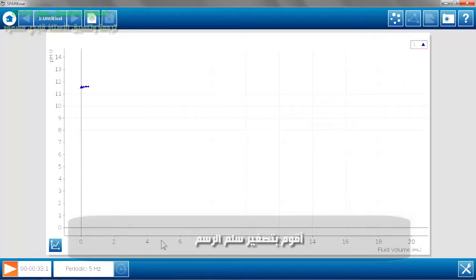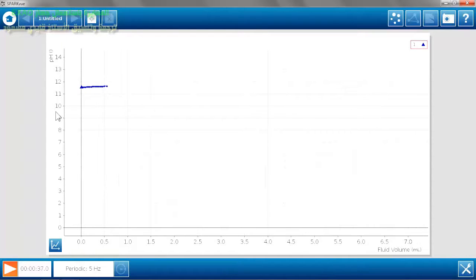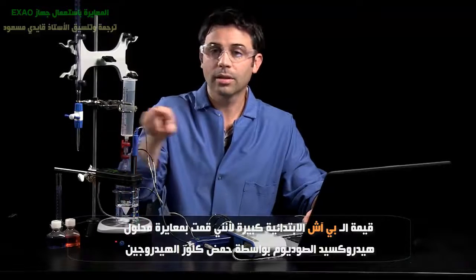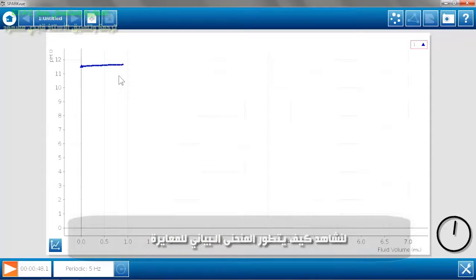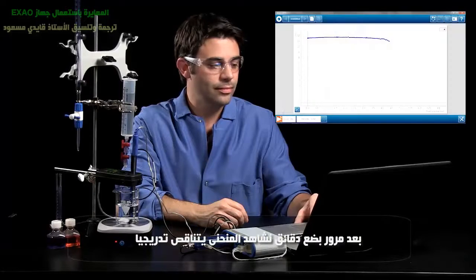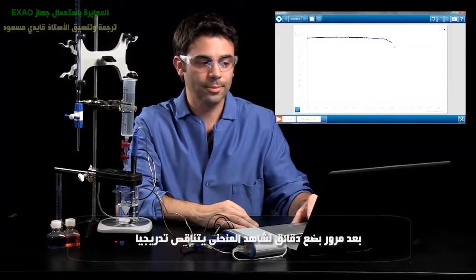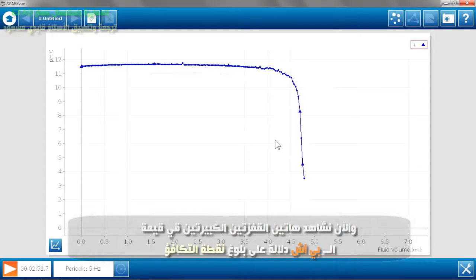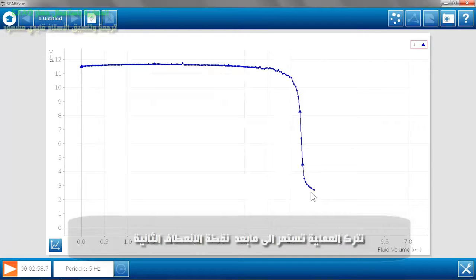I'm going to rescale my graph a little bit. Here's my initial pH — very high because I'm titrating sodium hydroxide with hydrochloric acid. After a couple of minutes of data collection, the pH is starting to gradually go down, and now it's going down steeper. Now we see those big drops in pH that are indicative of the equivalence point being reached. We'll let this go a little bit longer to round out that pH curve.